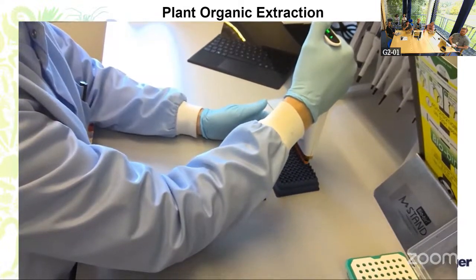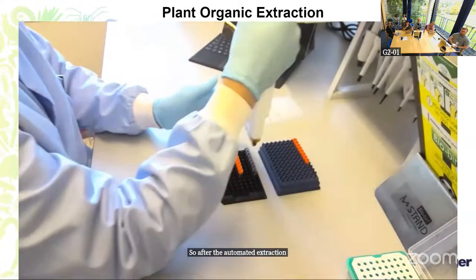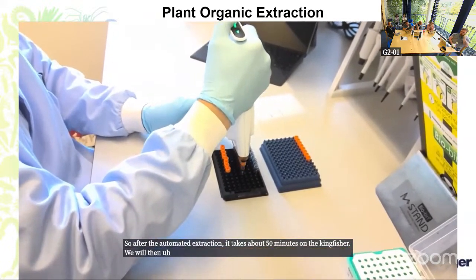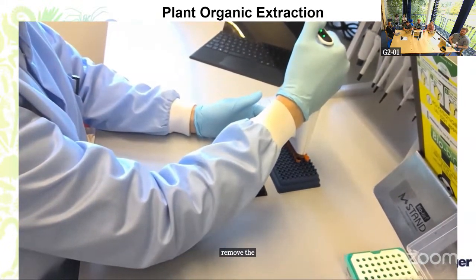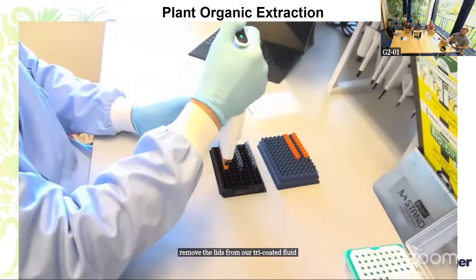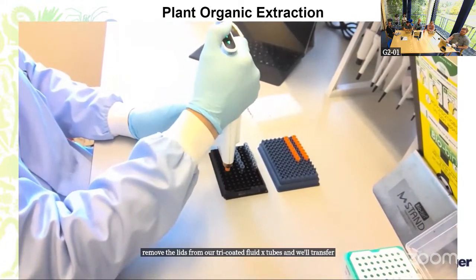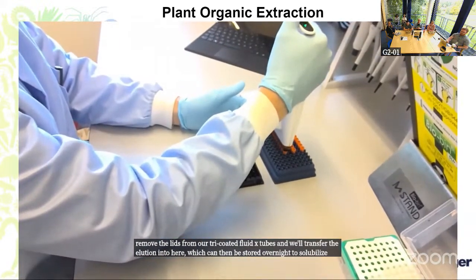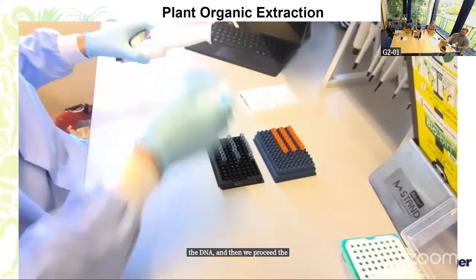So after the automated extraction, which takes about 50 minutes on the KingFisher, we will then remove the lids from our tri-coded FluidX tubes, and we'll transfer the elution into here, which can then be stored overnight to solubilize the DNA, and then we proceed the following day to DNA QC.